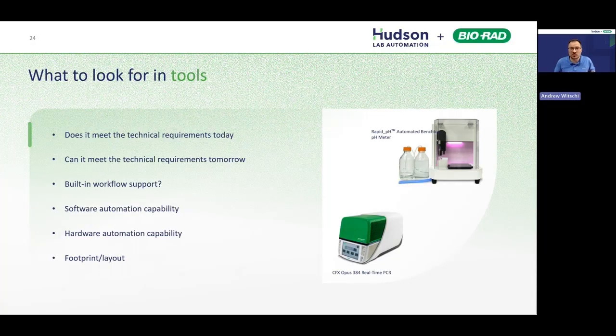A good example would be a fluorescent reader right now. Rather than just doing reading, we've got readers available that do injection of small amounts of reagents for kinetic assays, right? That typically would have been a workflow, where you had to do a dispenser combined with a data acquisition device and pair those together with some other automation. But vendors are driving that towards giving you the ability to do workflow-based automation within a single platform.